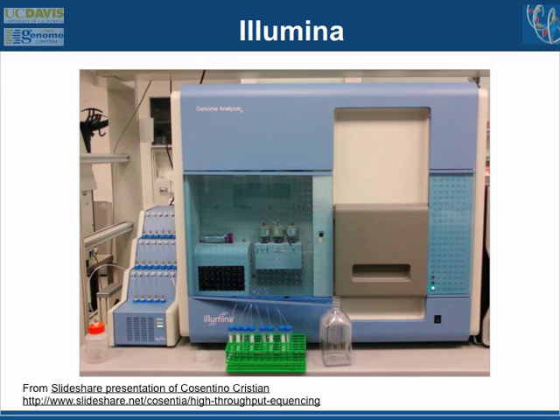Yeah? Just wondering how you have these plates with all these microscopic wells in them. How do you clean the machine? Like, contamination is a big problem with PCR-based stuff. Yeah, so you have a new cell for each time you run it, and you're, in theory, supposed to run the emulsion PCR phase in a separate place from where you run the sequencing phase.